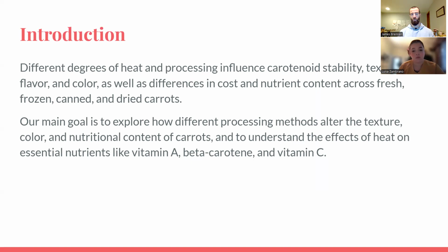So, our main goal was to explore how different processing methods can alter these factors: texture, color, nutrition content, and to understand the effects that heat has on certain essential nutrients like vitamin A, beta carotene, vitamin C, among others.